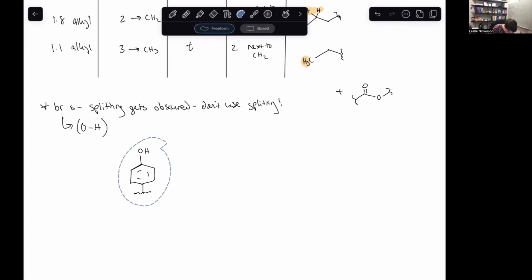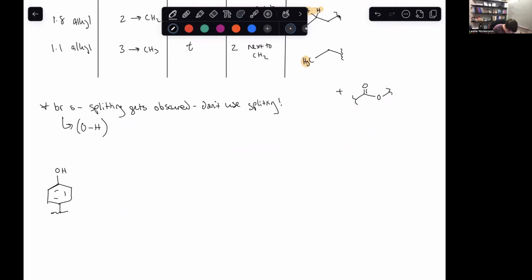I'm gonna see how this works out, but I'm gonna try to do a progression here. Okay, so we can have one of those two options, essentially.